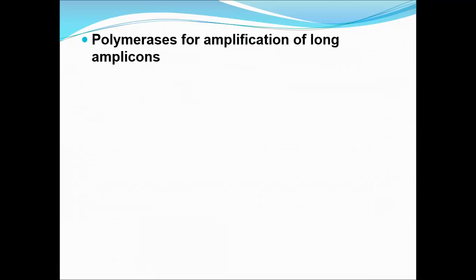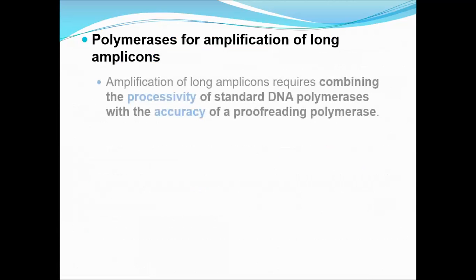Then the polymerase for amplification of long amplicons, that means you need a high processivity enzyme.